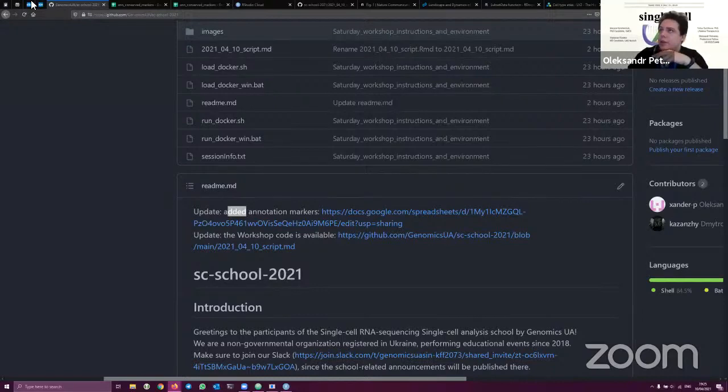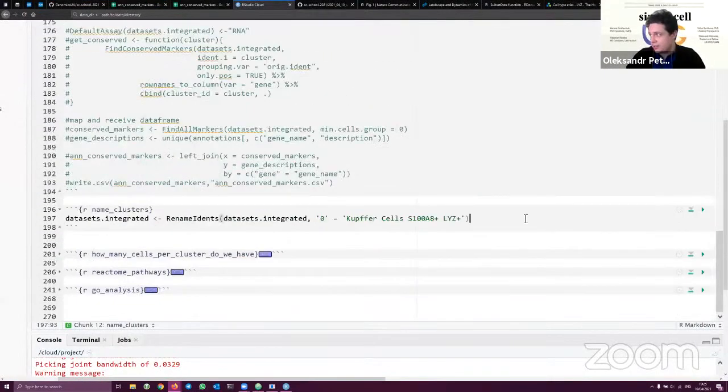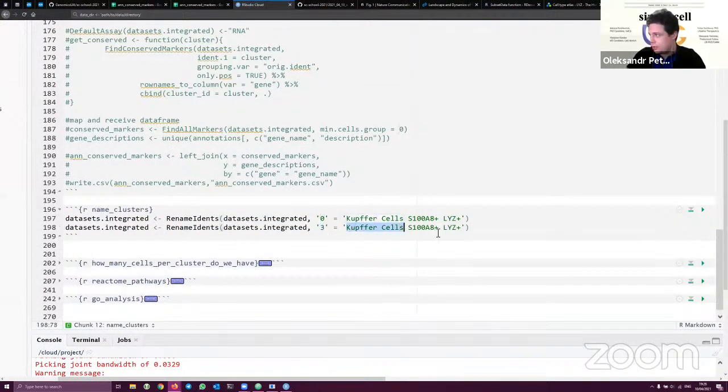Oh, okay. Thanks, Andrea. We actually have already cluster 3, and I will ask you to actually tell us what you think, according to the database, the name of the cells is, so we can just write the human readable name. So it's T cell receptor alpha constant and interleukin 32, CD3D molecule, osteonectin, CD2 molecule. According to the expression in liver and blood, what do you think the cells are? I mean, it's definitely T cells, right?